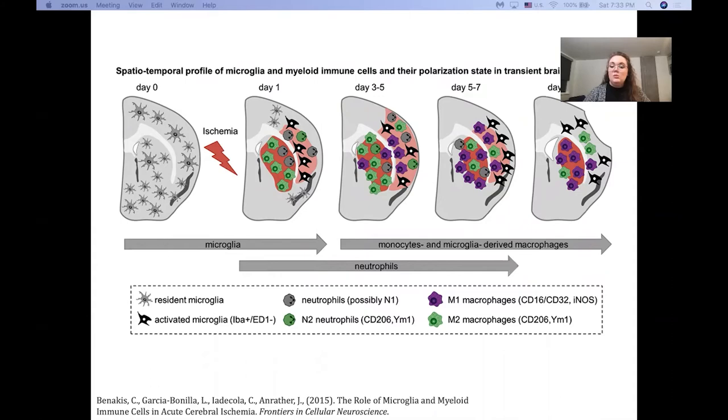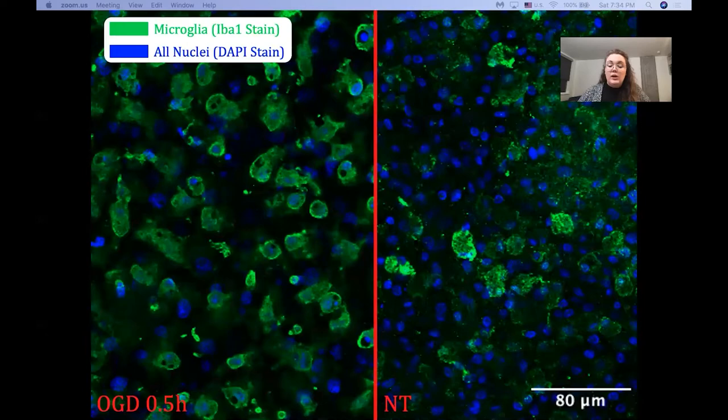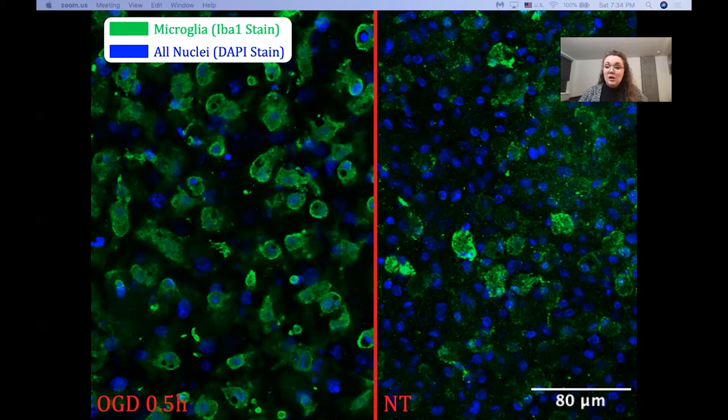So when we're studying cell shapes in our experiments, we actually get to study and quantify the difference in cell shape features amongst our groups, such as the injured group OGD at half an hour here and our non-treatment group. Just by the eye, it seems like the OGD cells are slightly more circular than the non-treated groups.